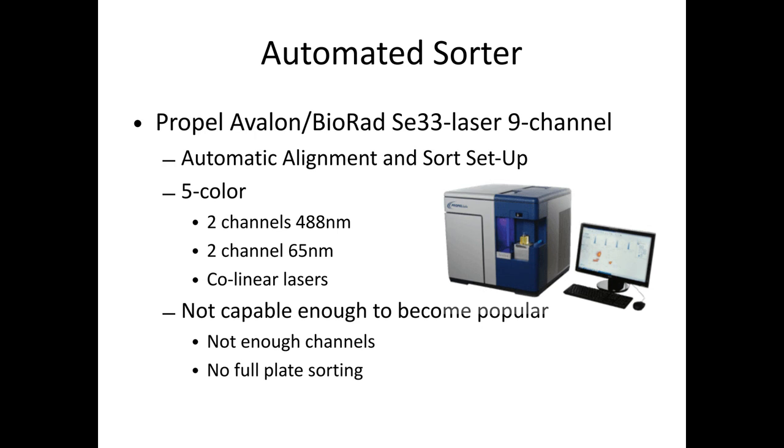It was pretty cool. And my original thought was this would be really popular with the user base for self-service. But it turned out it was just not capable enough to become popular in my lab. There weren't enough channels. There's only 2 lasers.